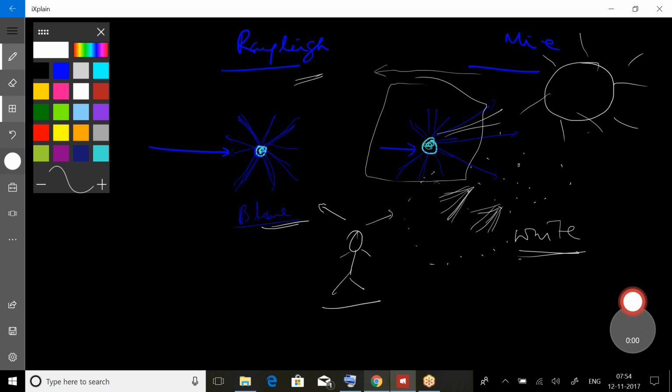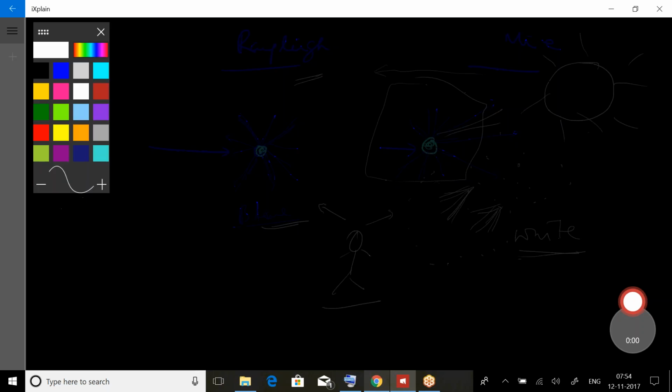So how does it work in flow cytometry? What are the measurements we will make because of this scatter? Again, we will draw a cell and shine light on it.